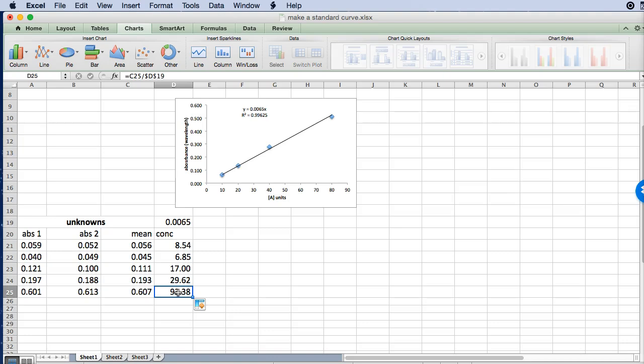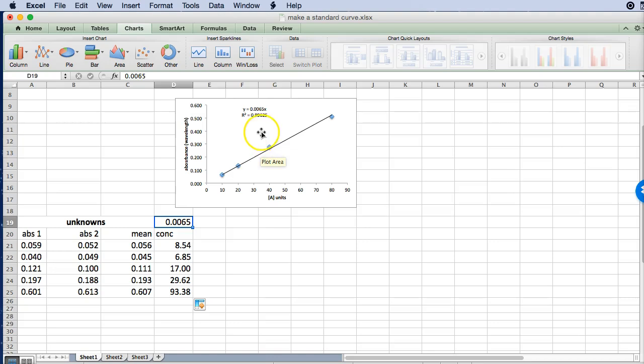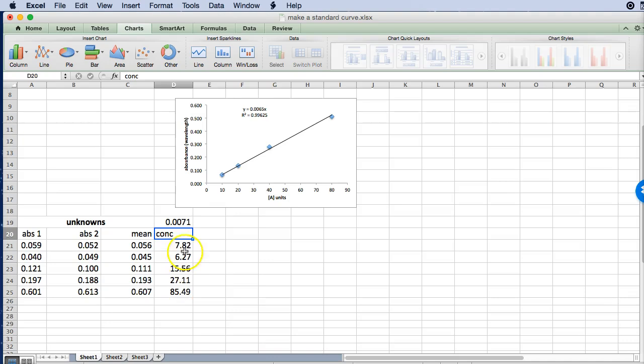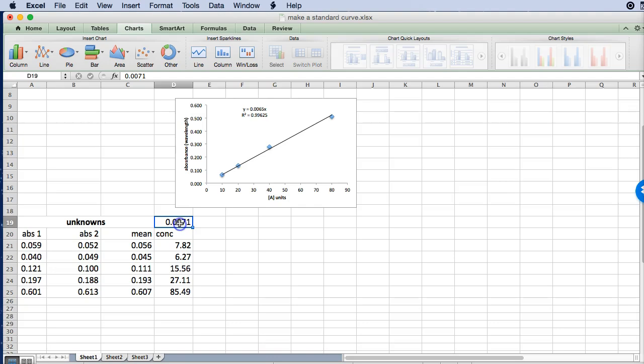So you can see we get the exact same values. Now the advantage of doing it this way particularly when you have a whole lot of data is that if you figured out later that you've made a mistake here and you wanted to change these numbers you just type in your new value and all of these will update to the new concentrations. So in this situation it's not obviously that useful but there's many other situations where typing things in as constants and using absolute references can really speed up modifications later on.